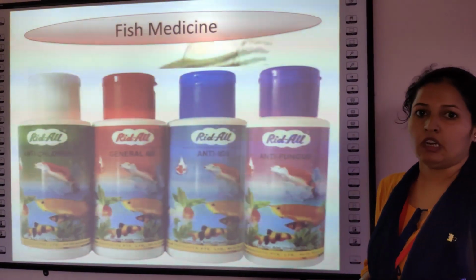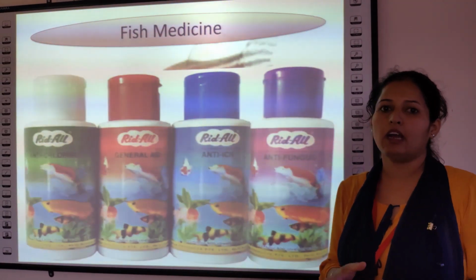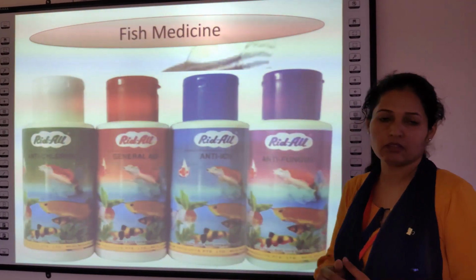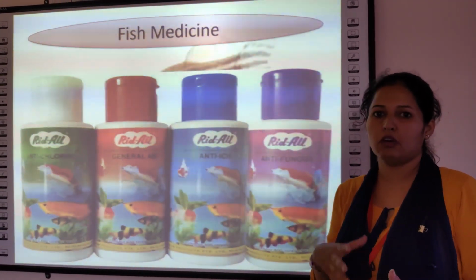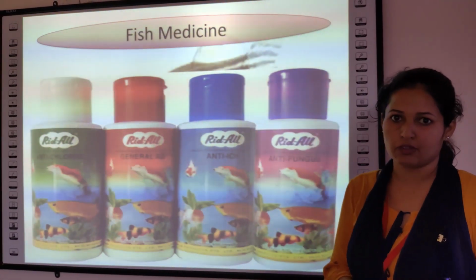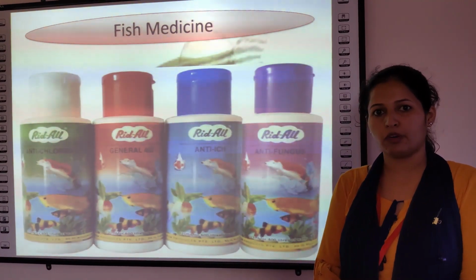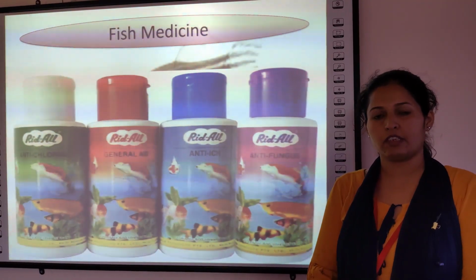Apart from this, every alternate day we change the water of the zebrafish, and after we change the water, we add a few drops of these medicines which prevent the growth of fungus, which provide the favorable atmosphere for the development of zebrafish. So this is all about the basics of zebrafish as a research model and how we maintain zebrafish at our facility.